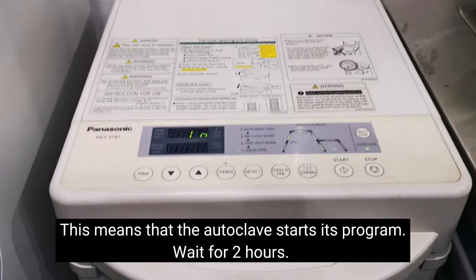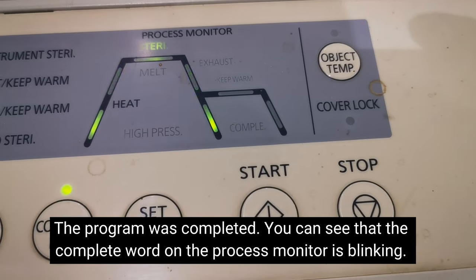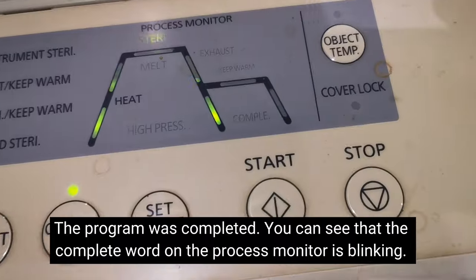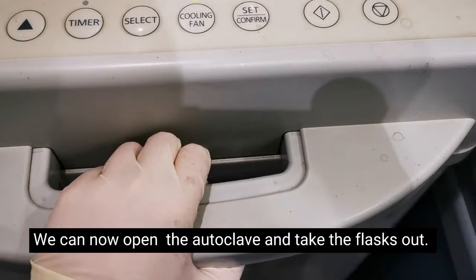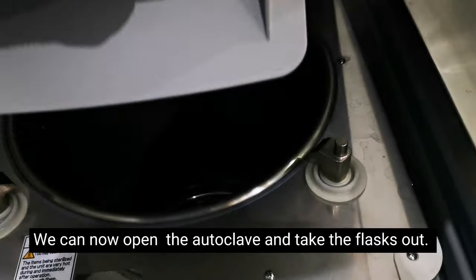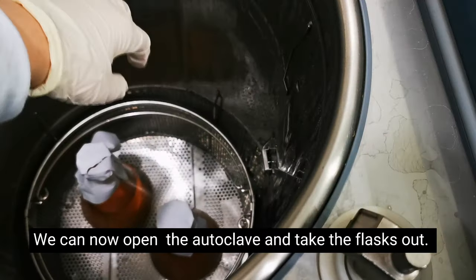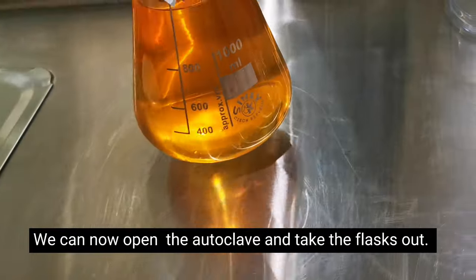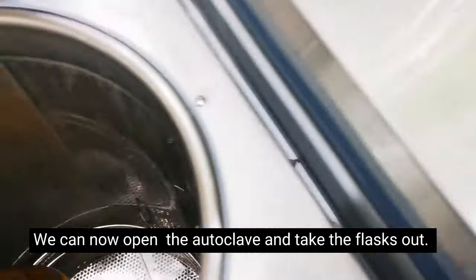Now we wait for 2 hours. After 2 hours, the liquid sterilization is complete — you'll see the 'Complete' sign blinking. You can now open the autoclave; be careful because the steam is hot. Make sure you don't lean your face close because it will be very hot. Now let's take out the agar — there it is, it's done — and the other one as well.